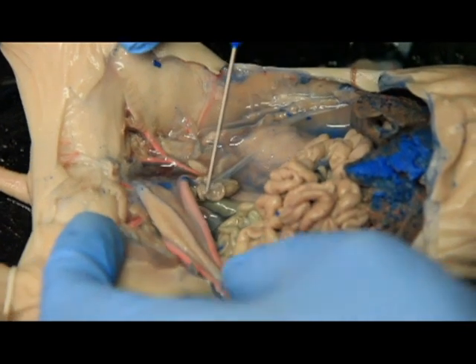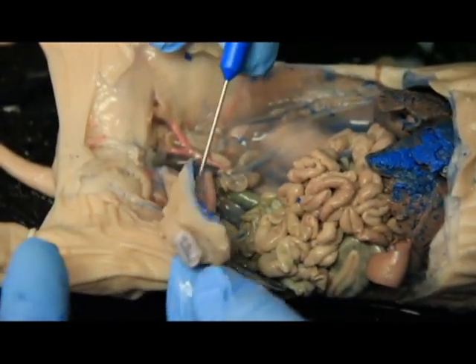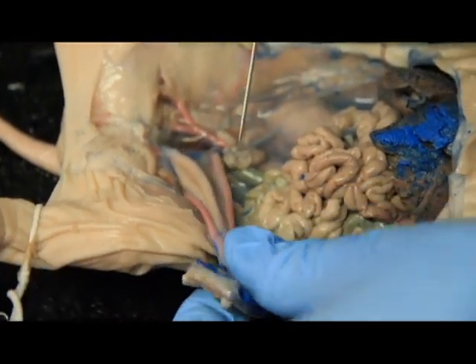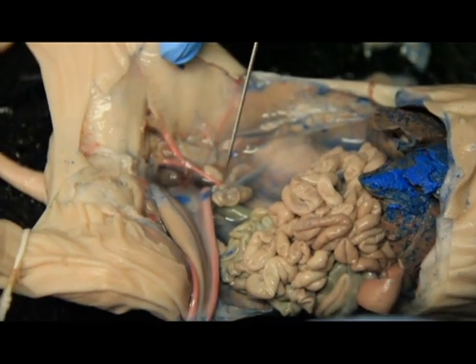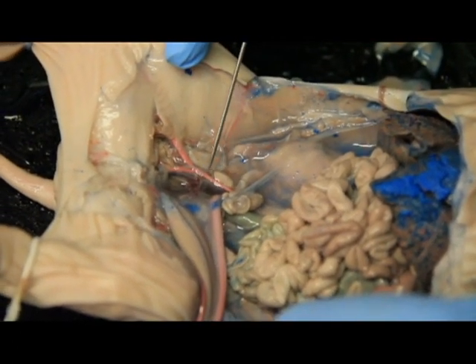Okay, so again, these are our umbilical arteries right here, going up the umbilical cord. That little blue circle here is the umbilical vein, which we've cut down here from the liver. And right about where this branches off, you're going to have this branch off the aorta right here. And that's going to be your iliac.